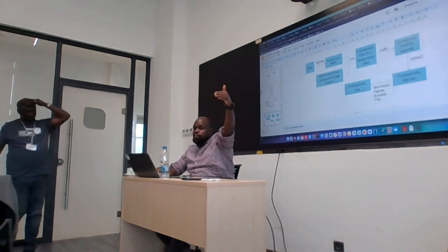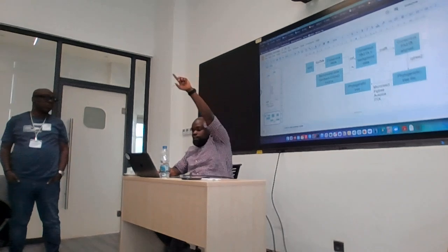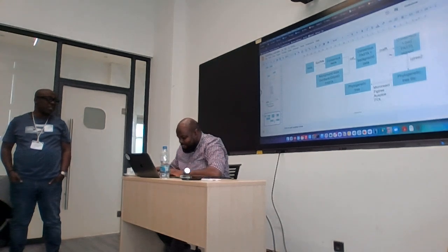We started with our fastq, right? Then we made a consensus file. In this case, we did not get background data, but I'm just showing you common practice. You can get some background data from GenBank or GISAID, and then you join them, concatenate, into consensus plus background data. Then we run MAFFT. We have consensus plus background, for consistency. Let me just say background here. It's not too long.